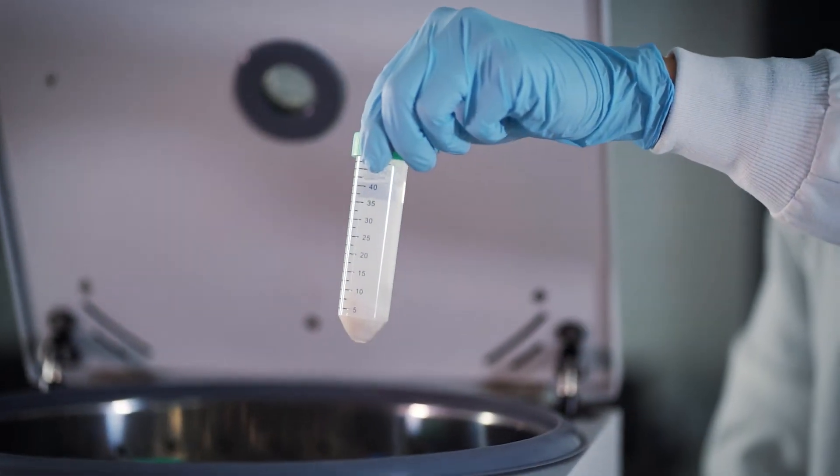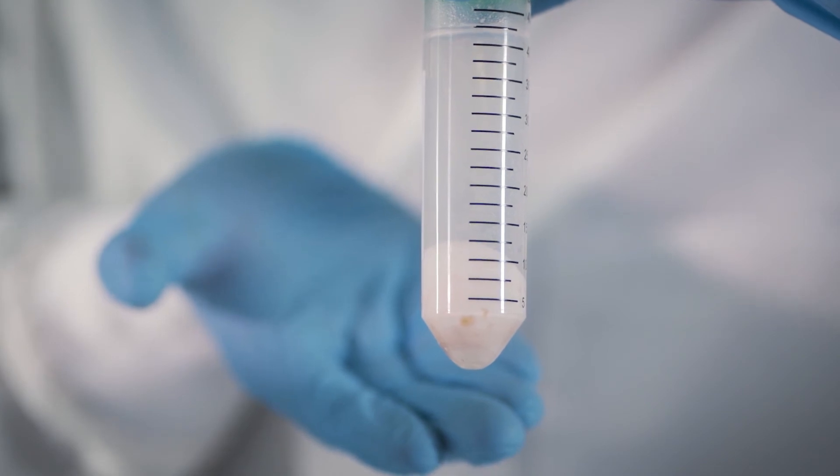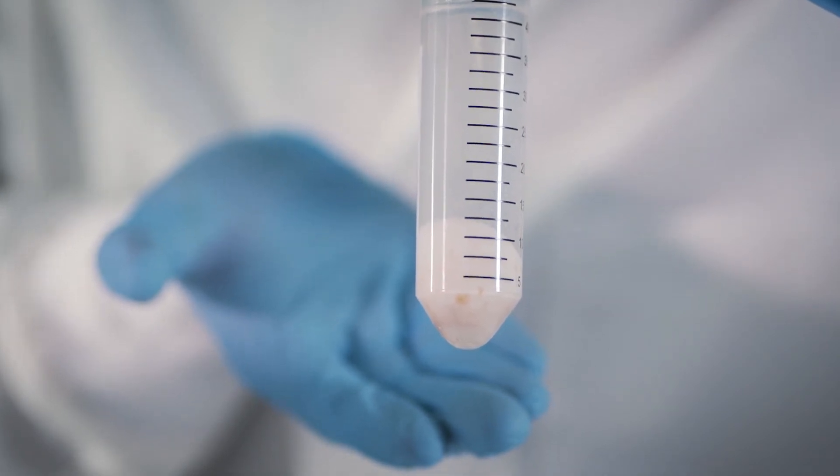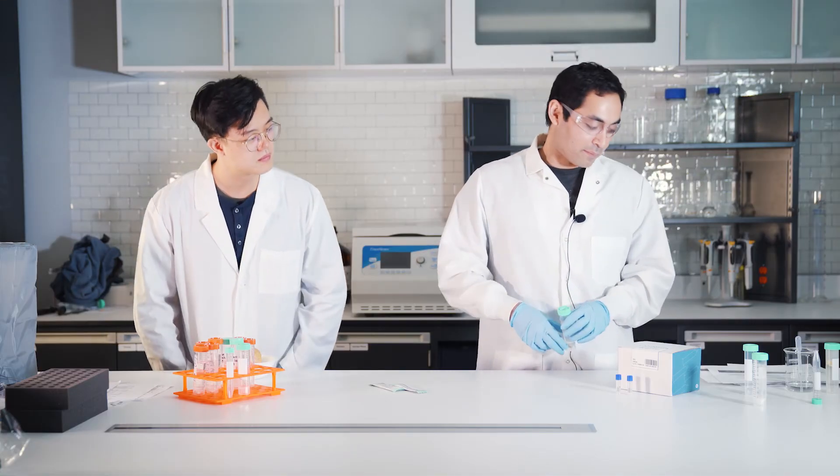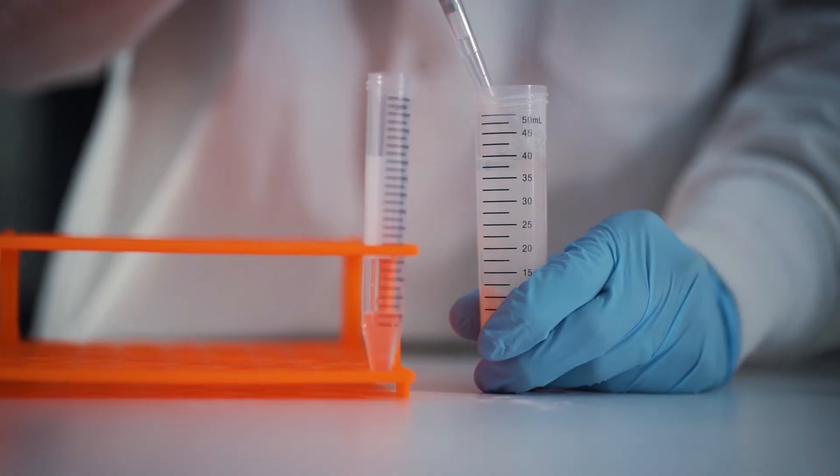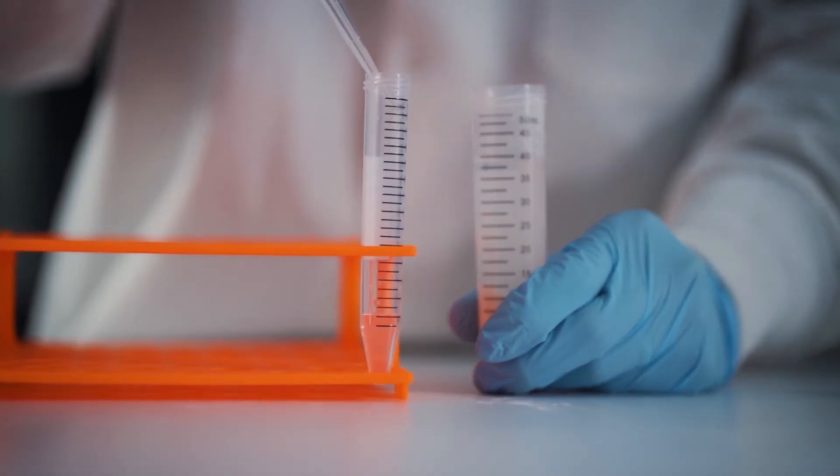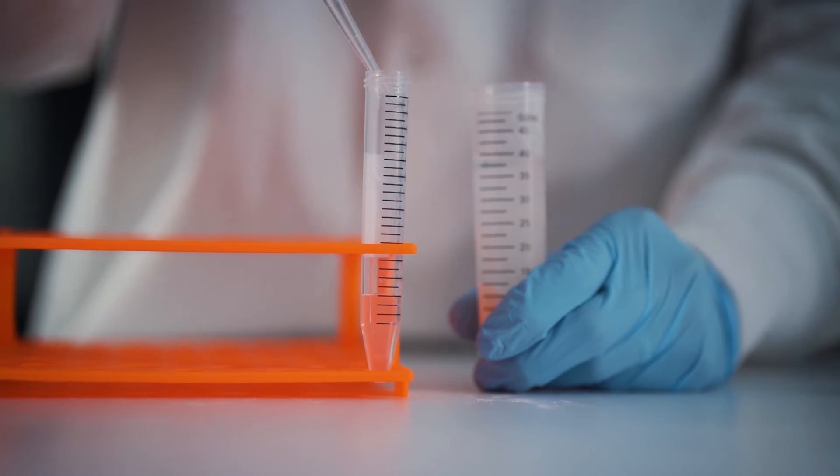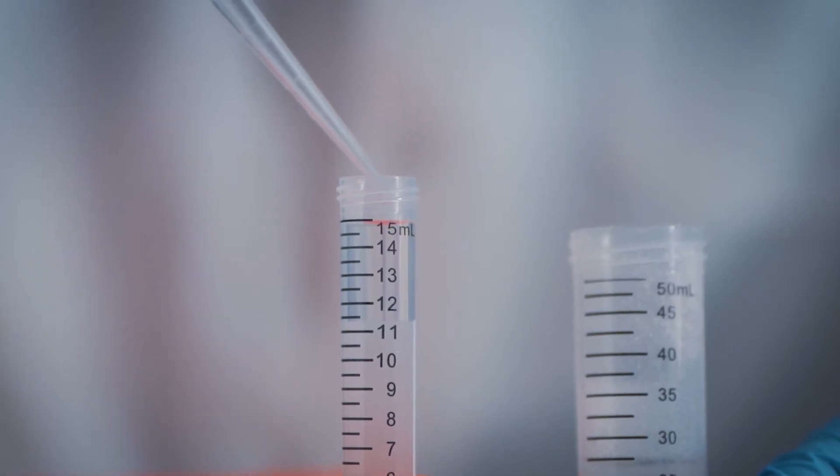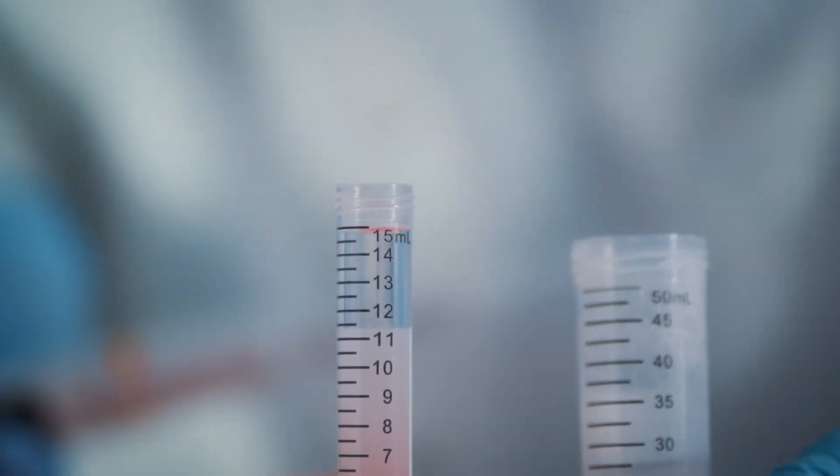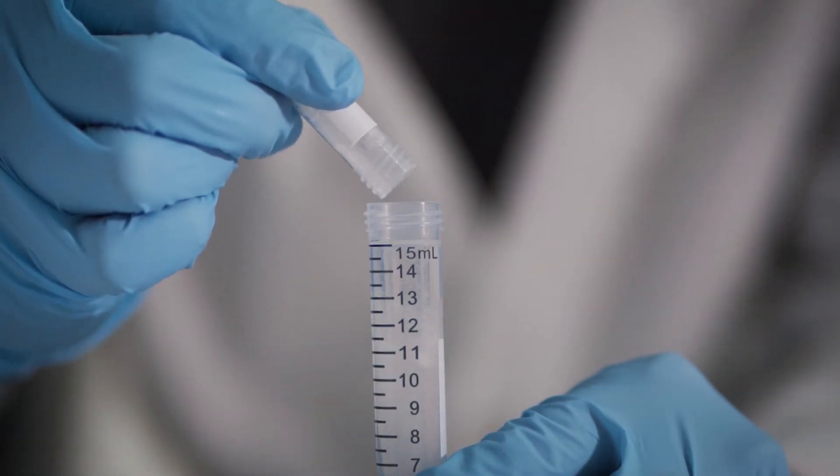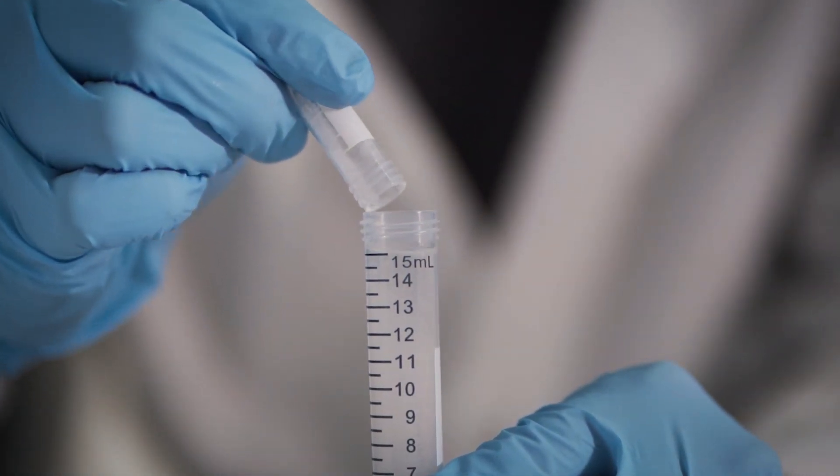Now that everything's centrifuged, you're going to notice that the sample separated in two layers. Now we're ready for the second step. You want to take the supernatant of the sample and pipette that into a 15 mL centrifuge tube, and it's time to add your dSPE salts.